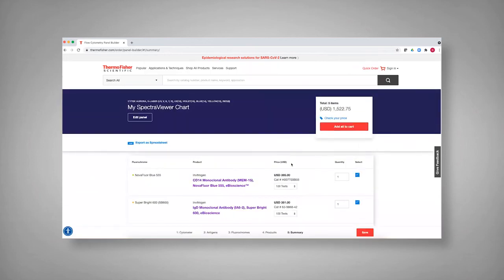And then the next step, it is a very simple process. It gives you the catalog numbers, the floors and the price for that process. So this would then allow you to purchase the antibodies as desired.